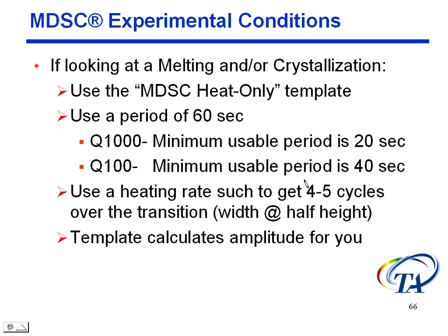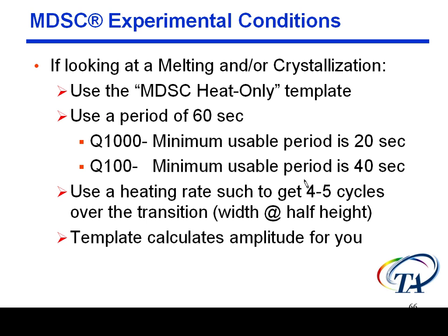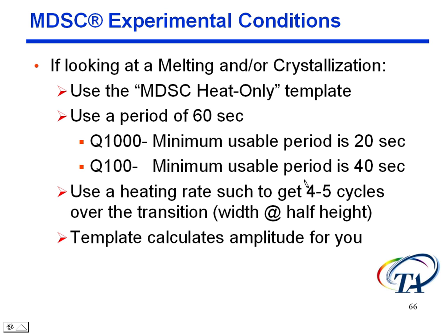Okay. Now let's say, what if we're looking for melting and/or crystallization? You would want to use the MDSC heat-only template. Now this template is described as heat-only, but it's really heat-iso, so that we heat up and go isothermal for a second, but never go cooling. Once again, I would use a 60-second period, but here's just a reminder of what the minimums are.